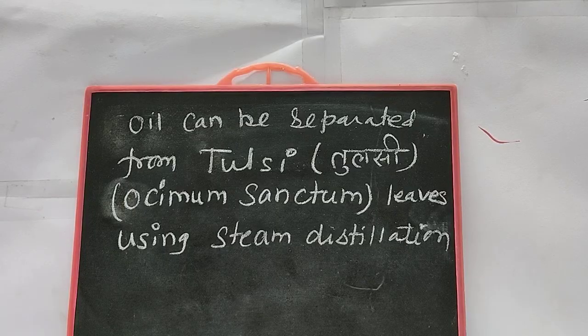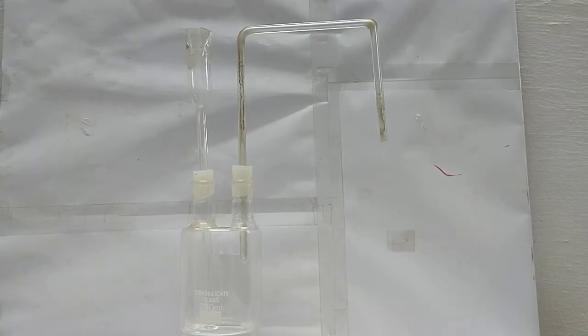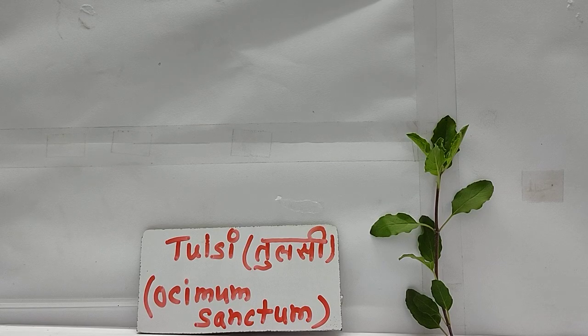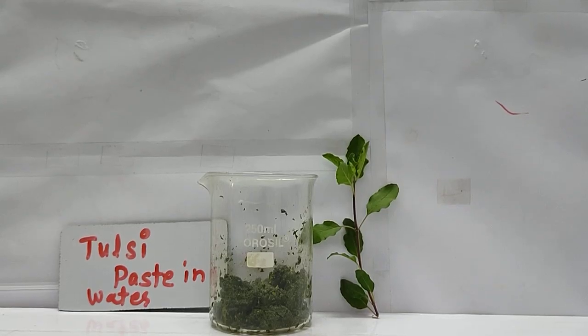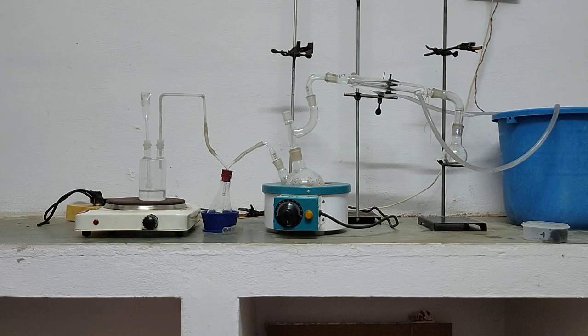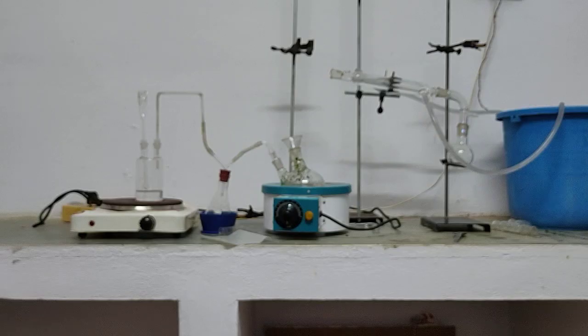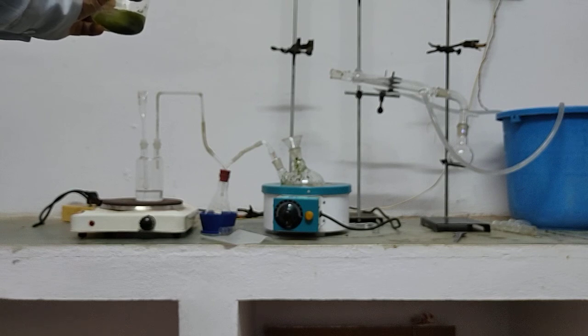Oil can be separated from tulsi. Steam generator and tulsi paste are prepared. The arrangement for steam distillation is set up with tulsi paste in a round bottom flask.